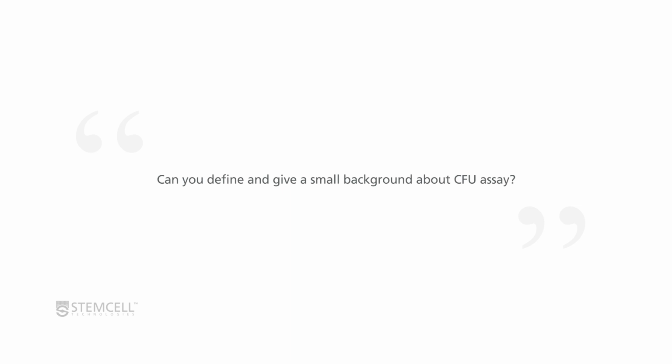For humans, it takes 14 days, and then you get images like you saw on the slide deck. And then you have to score those. You have to go colony by colony on an inverted microscope, of course. You need training so that you get used to doing that. It usually takes a couple of months. And it also takes about 5 to 7 minutes a plate, or a well, where something automated can be done in a minute. Anyway, that was a long answer to a short question.